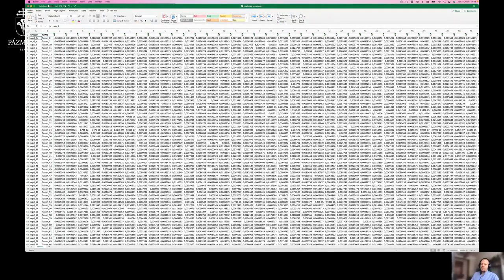In the first column, we have a unique ID for the individual taxa, and in this column, we can see which taxa we are looking at. In the first row, there is a label for each column, because in this example, we have some additional information about the patient.